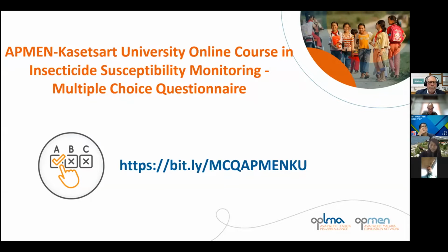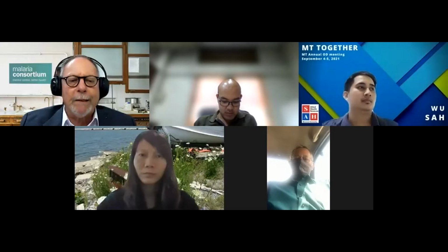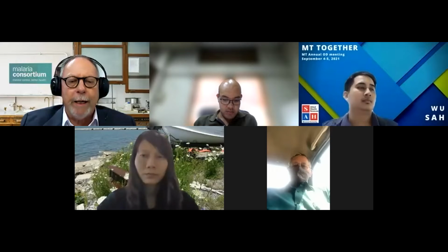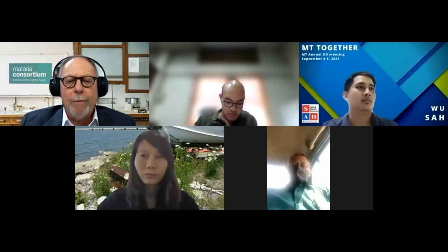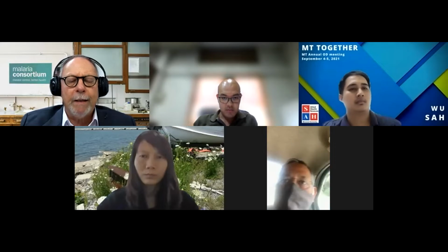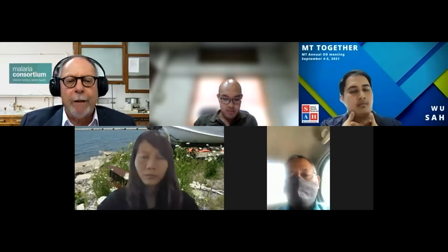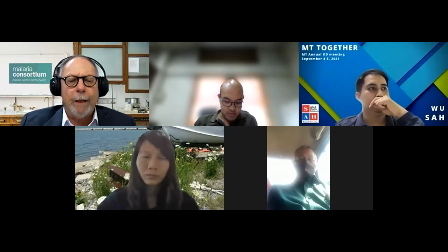Okay, so let's go to the first of the two tutorials today. The first one is about the CDC bottle bioassay. So I'd like to mention that like the WHO paper tube bioassay, the CDC bottle assay is also used to check for the presence of insecticide resistance in a mosquito population.